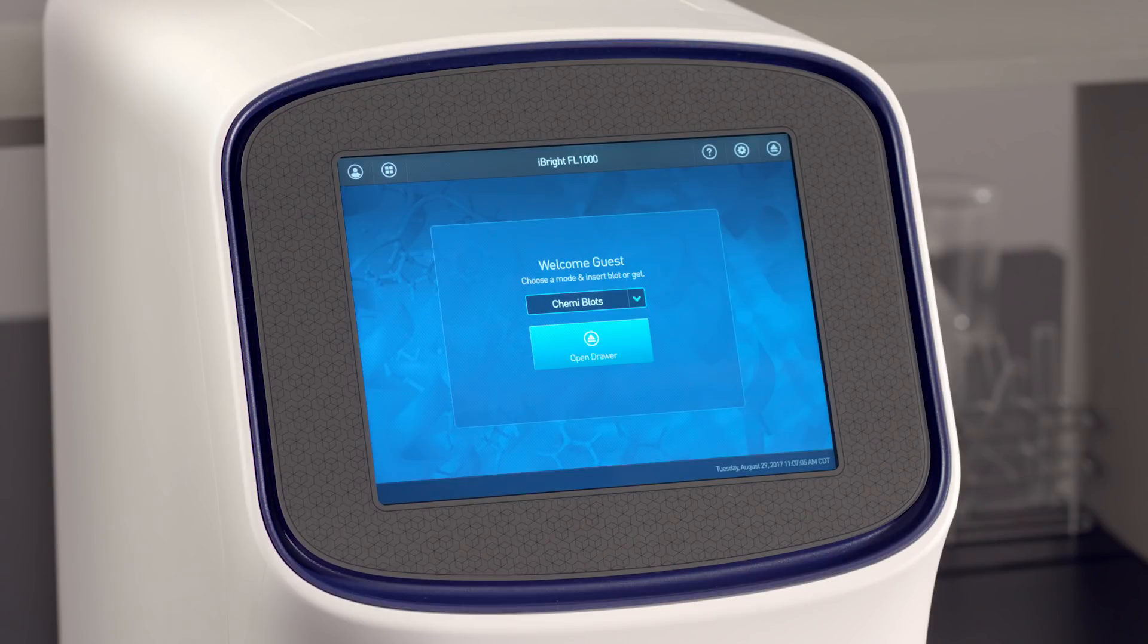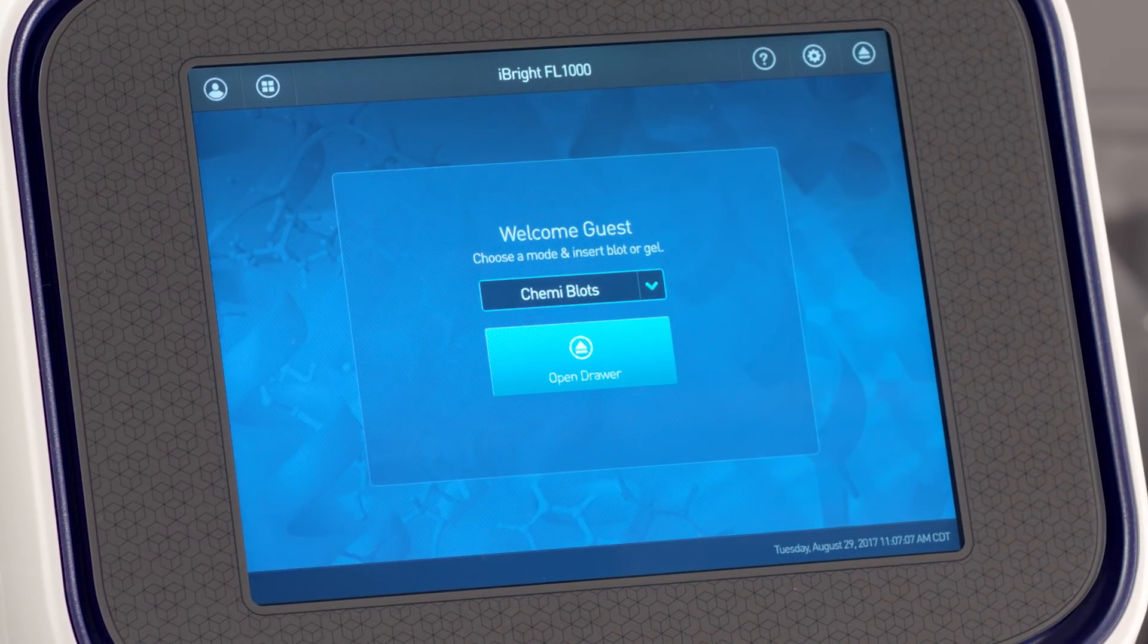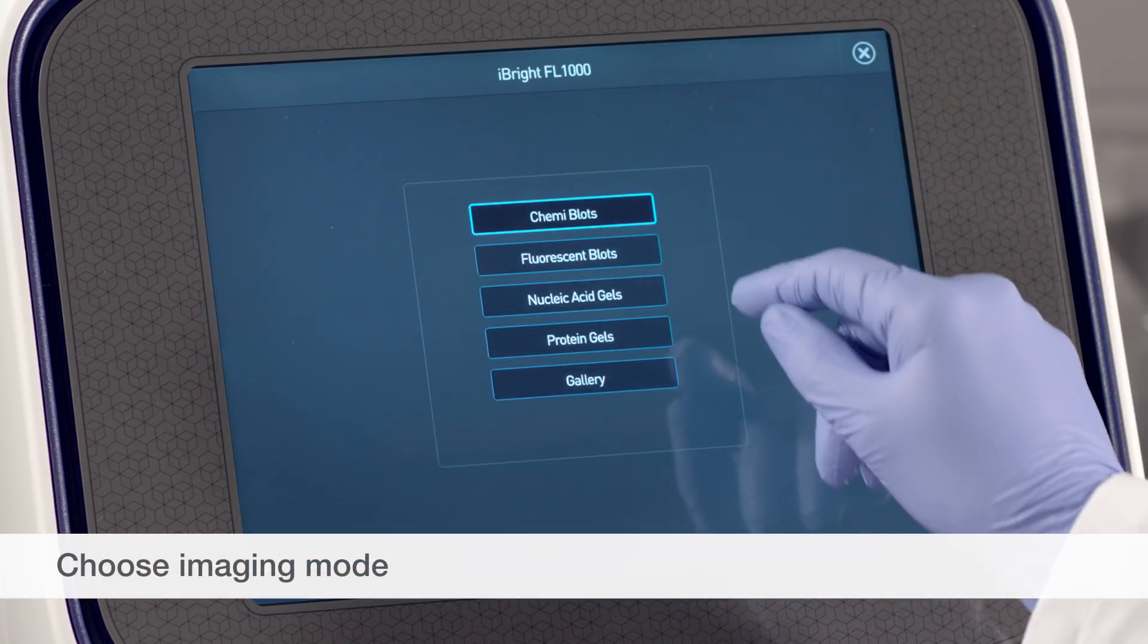Capturing images within Vitrogen Eyebrite imaging systems is fast and simple. Under the drop-down menu, select an imaging mode.